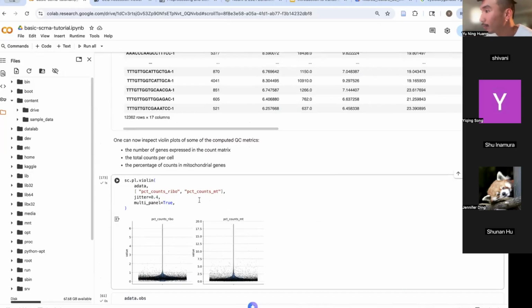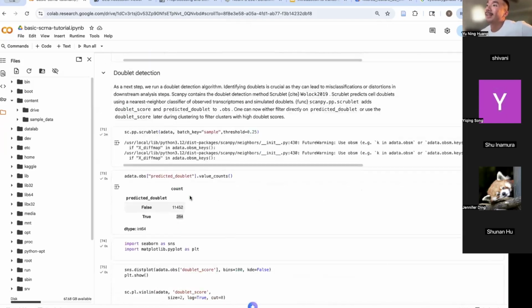And then you can see for this, huh? Oh, sorry, I just had a question. You can continue. Oh no, no, no. After you. So both single cell RNA-seq and bulk RNA-seq have the same end result, right? They basically tell you the gene expression of the cells that you've given for processing.